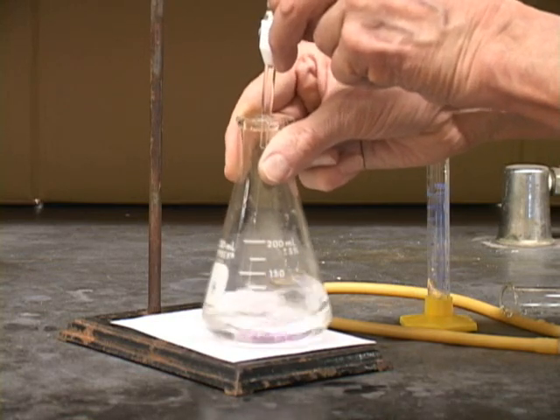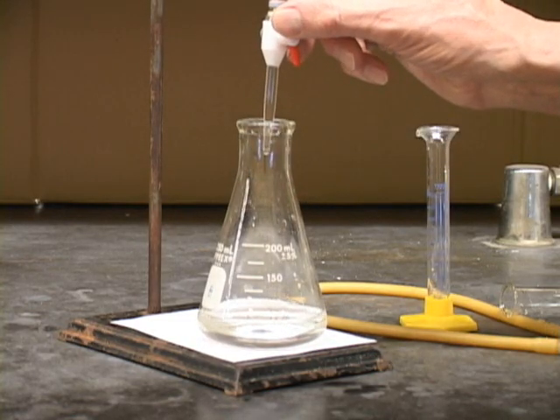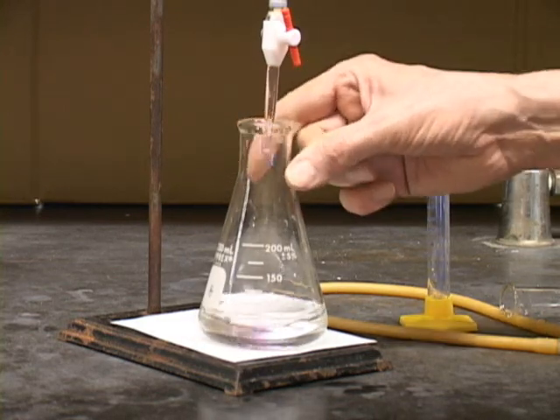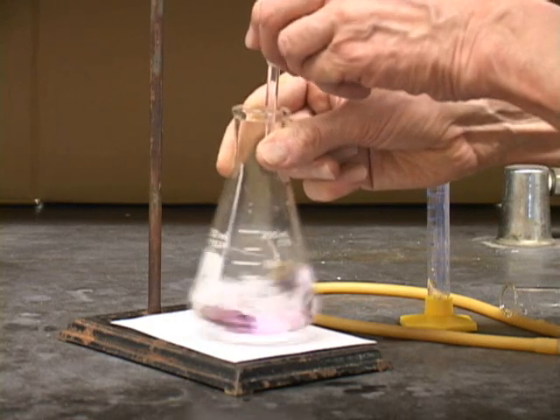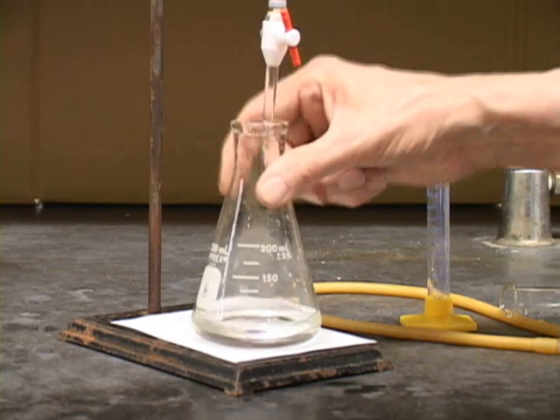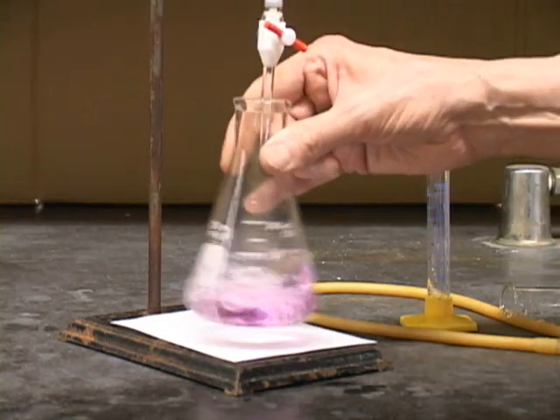When the red spot gets bigger, slow the titration to a dropwise addition. Now, slow it down even more. Add the last drop. That's the end.